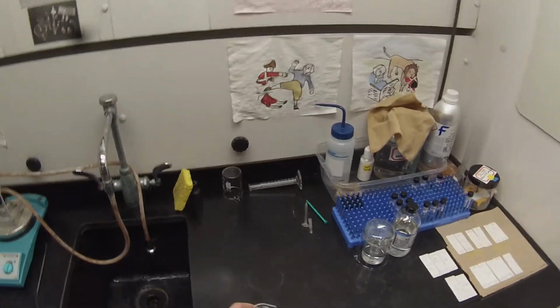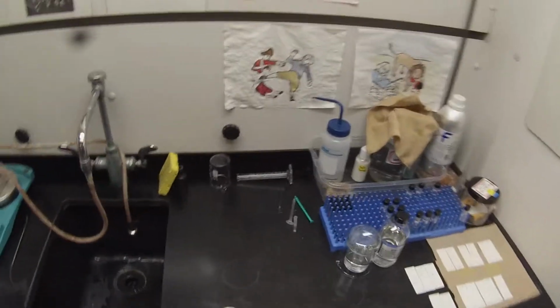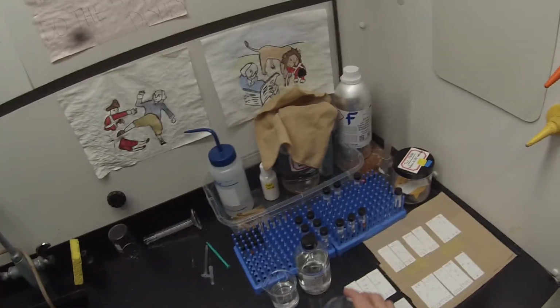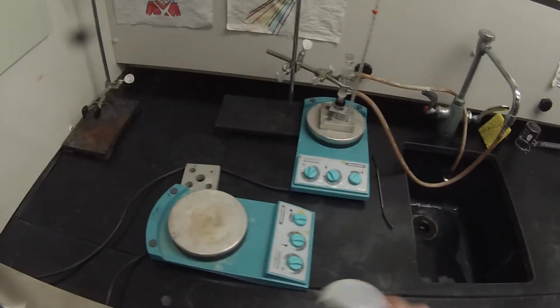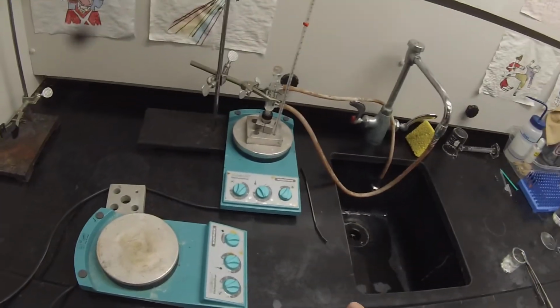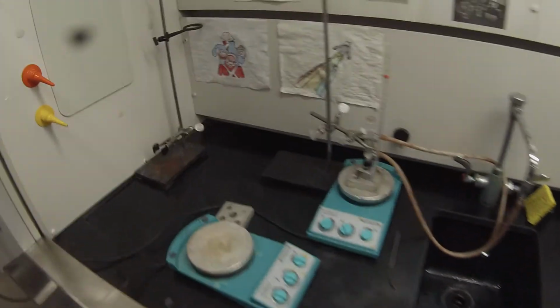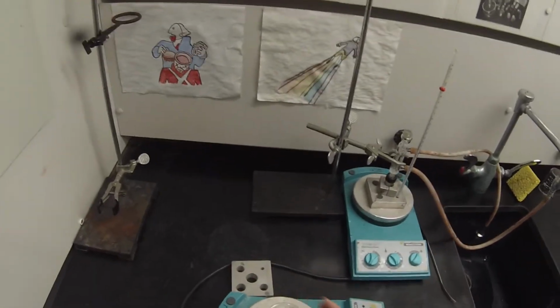First thing I need to do is take the piece of filter paper out, which I'll get with tweezers. And then we're going to heat this 50% ethanol, which we made the other day. And I'm going to stick a stir bar in there so we don't get any localized hot spots. And we're going to want to get that up close to boiling.